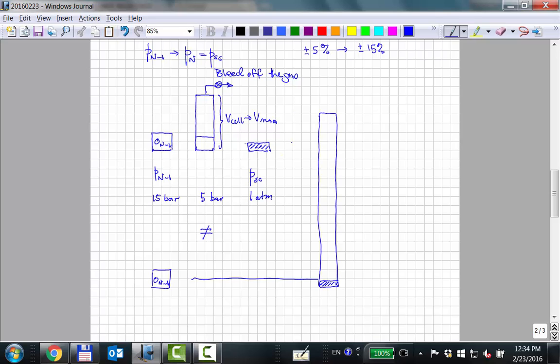So the main difference is that these two oil volumes, this is down at 1 atmosphere, these two oil volumes here are definitely not equal. The moles of gas that comes out will be similar. I mean, it'll be different, but the biggest effect will be on that oil volume.